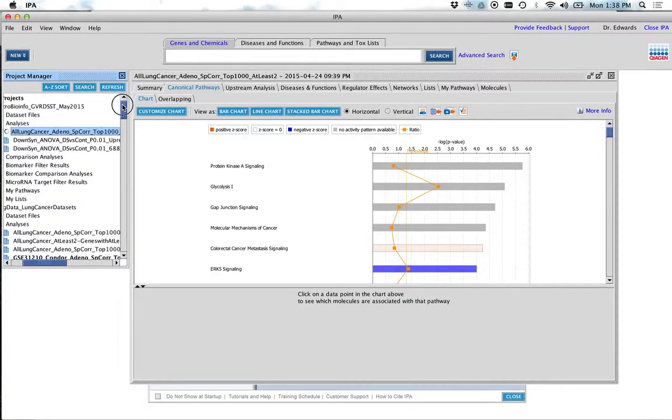Okay. So to reiterate, all the gene lists that we calculated, those 7 gene lists, this is how you're going to compare them. So you're going to download your gene list just like we did. Remember, you're going to have to figure out whether it's Illumina or Affymetrix. If you have any questions, go to the actual accession, find the accession number, go to Array Express or GEO and find out what array they used.